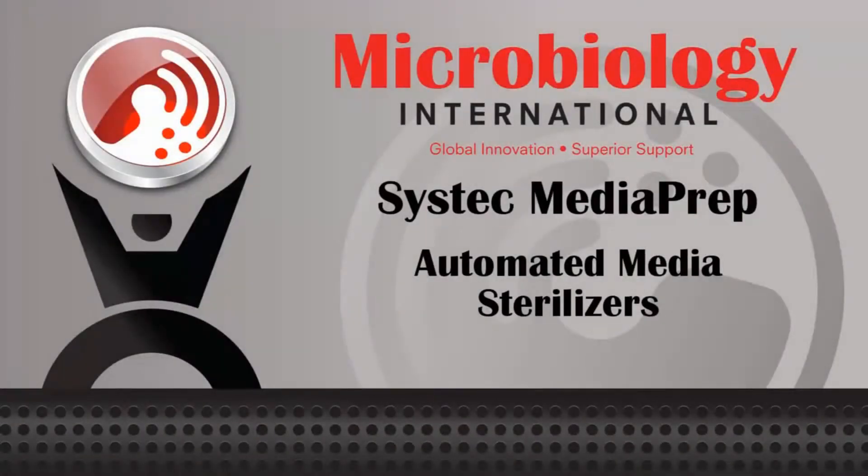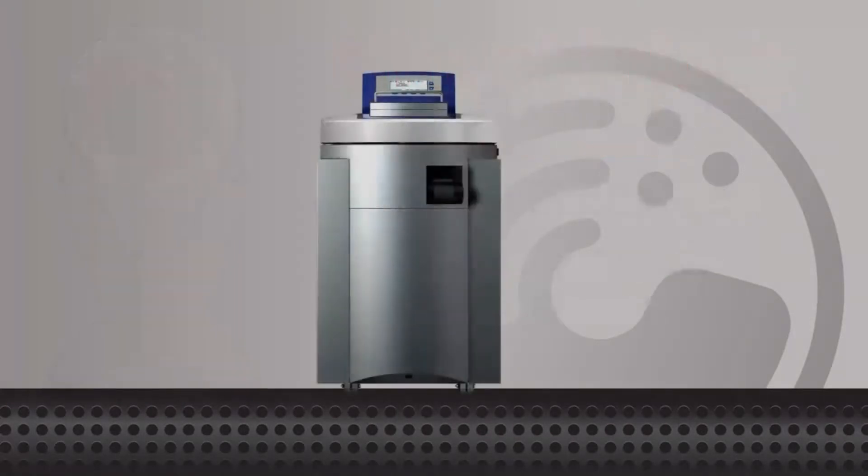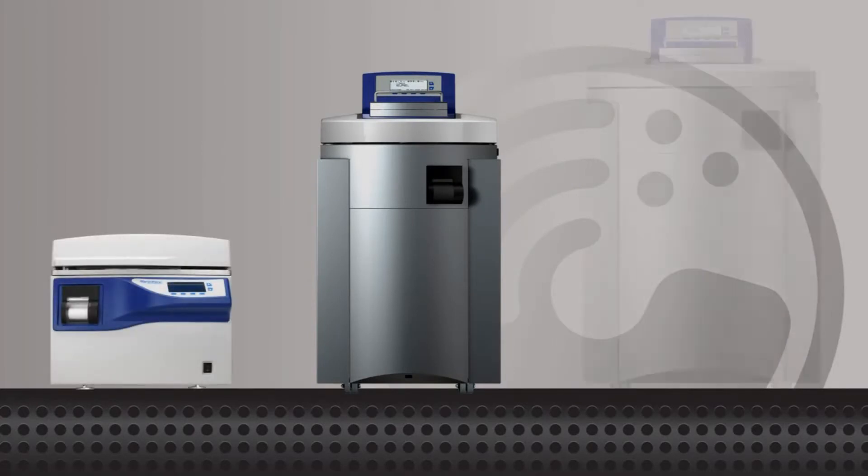The following is a video presentation for the SysTech Automated Media Preparation System. SysTech Media Preps are available in sizes that range from 10 liters to 120 liters.